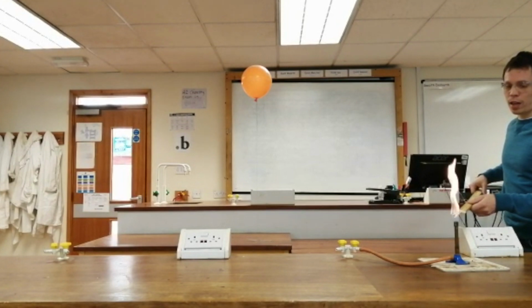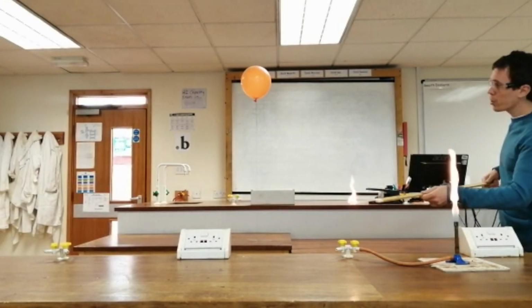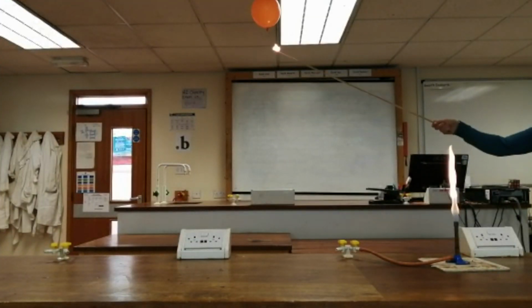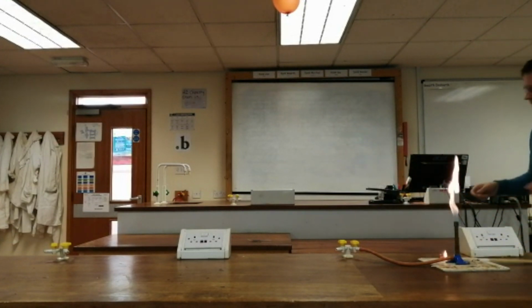So I light my splint just the same again, so this is a lit splint, pop it underneath the balloon to heat up the hydrogen. Oh my gosh. Should I do that again? Yeah.